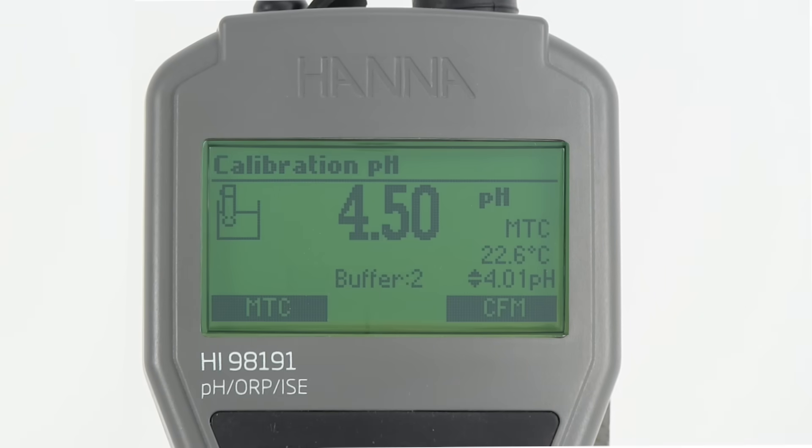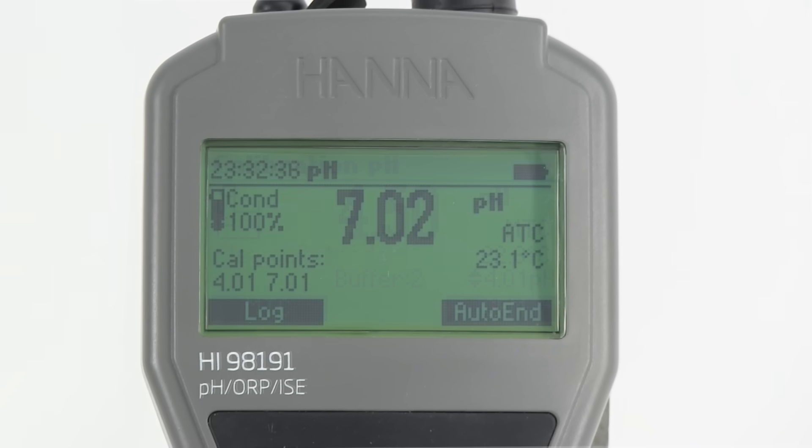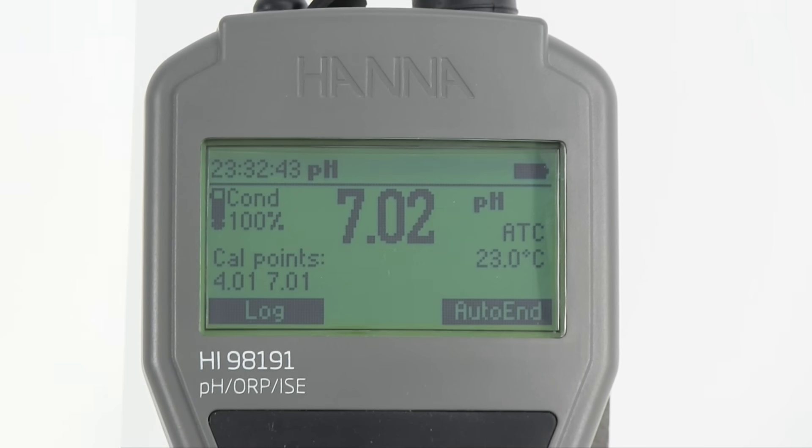CalCheck monitors electrode behavior over time and uses this data to alert the user to potential problems such as a dirty electrode or a contaminated buffer solution. The overall electrode condition is displayed on the measurement screen following calibration. CalCheck ensures stress-free, accurate, and reliable measurements.